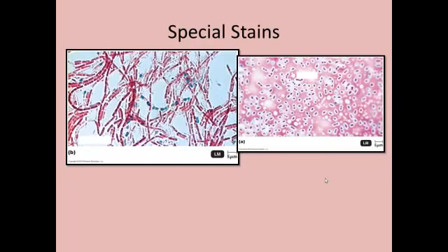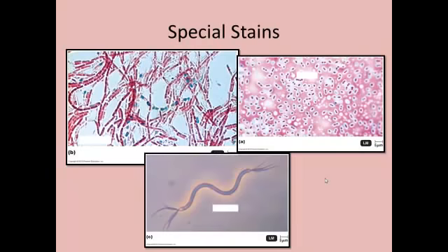Shows up capsules. Now this one is a flagellar stain. As we'll learn in the next chapter, flagella are hair-like extensions that help the cell move. And they're very, very thin, and they're very, very hard to see. With some high-quality light microscopes, you can see them. You can see them with phase contrast and dark field microscopes. But often what we do is we apply a flagellar stain. It's kind of like applying makeup, okay? Mascara to eyelashes. I don't know about the rest of you, but I've got skinny blonde eyelashes that you can't see. So what do I do? I coat them with mascara. So this is the same thing as a flagellar stain. We coat those flagella with the dye that makes them able to be seen.